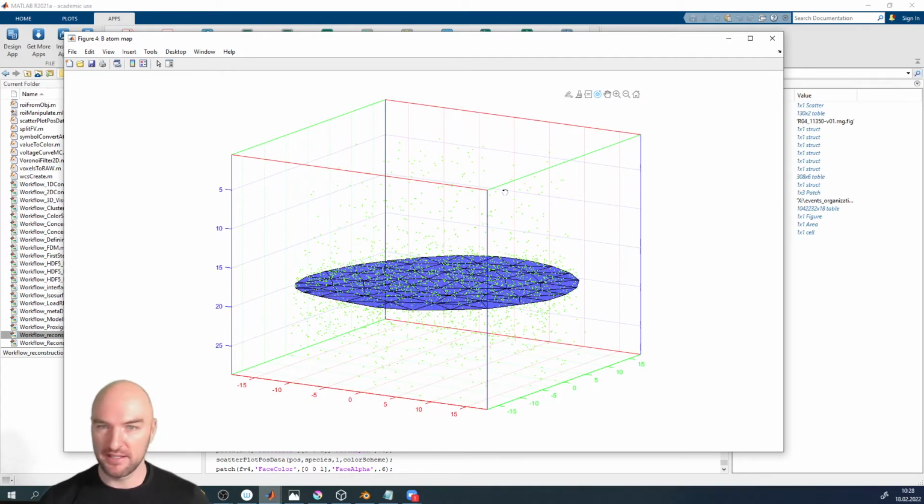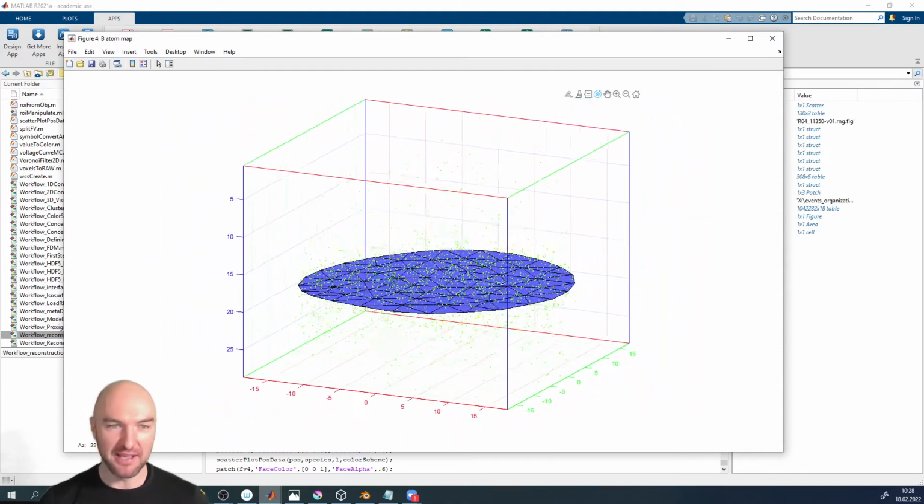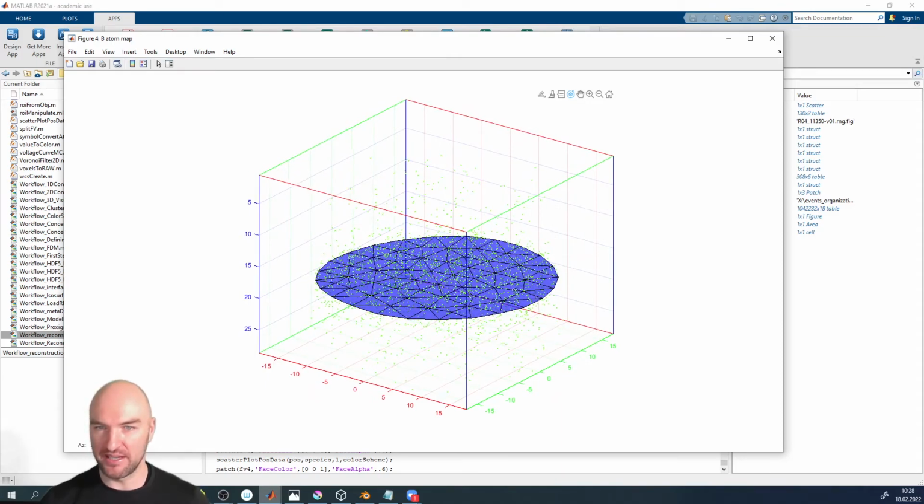Okay, and with that, I think we're pretty much at the end of the first session. Questions? Do you have questions? How many of you made it to a reasonably good-looking grain boundary model? One person. It's better than nothing. I think Martina's green tick was still there from earlier. Okay, you might just need a little bit of practice, yeah.